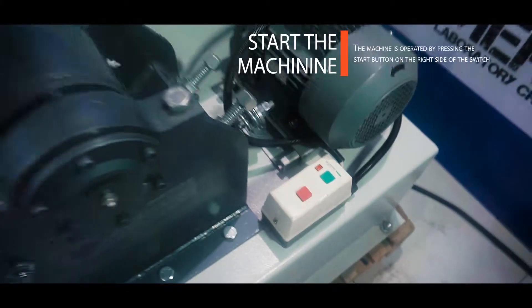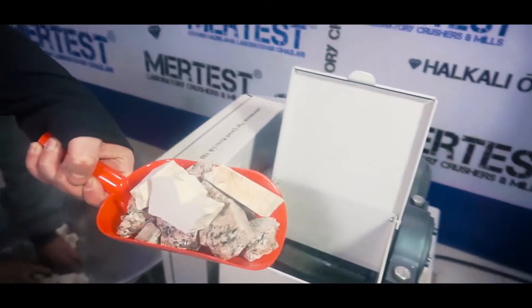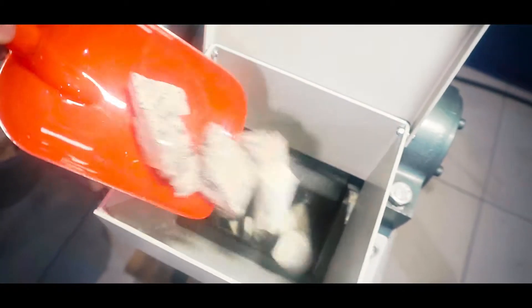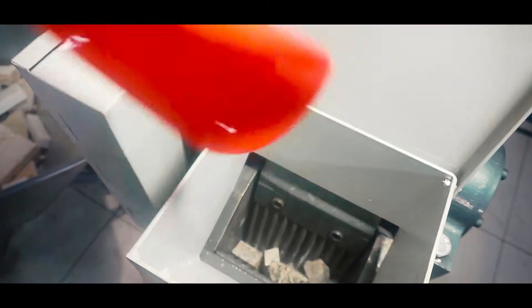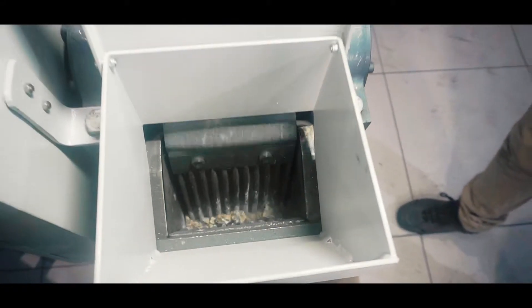The machine is operated by pressing the start button on the right side of the switch. Maximum feeding capacity of the machine is 100 millimeters. By opening the top cover of the hopper, we slowly feed the ingredients to the machine.